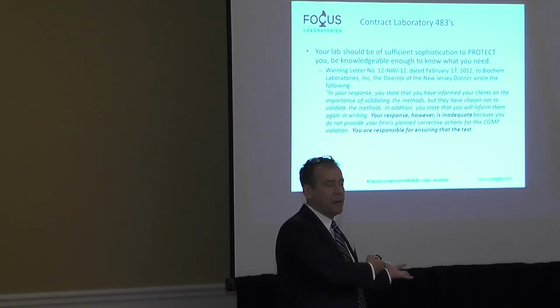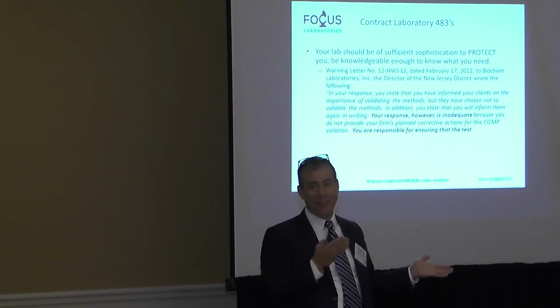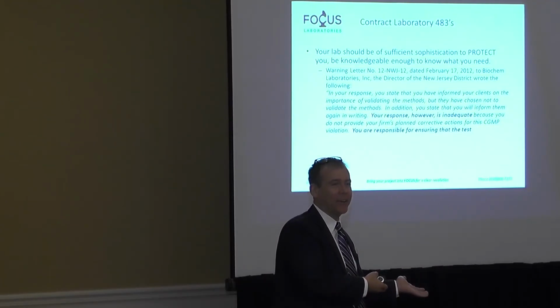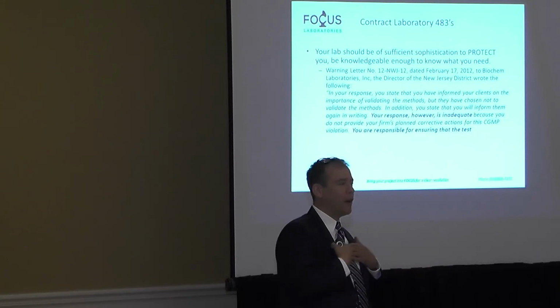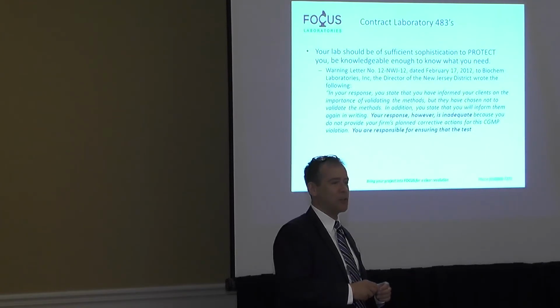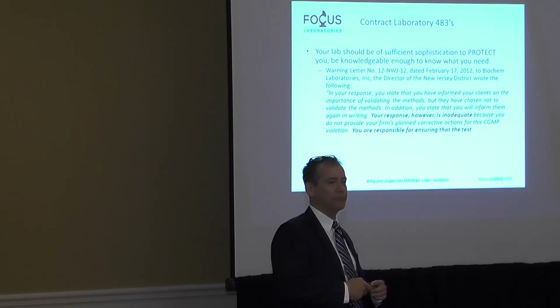And why didn't you validate it? Well, the customer didn't want to validate it. Well, too bad, that doesn't work. So we're liable, you're liable, everybody's liable. We all know by now it's 2018, methods have to be validated. Make sure your lab protects you in those ways too.